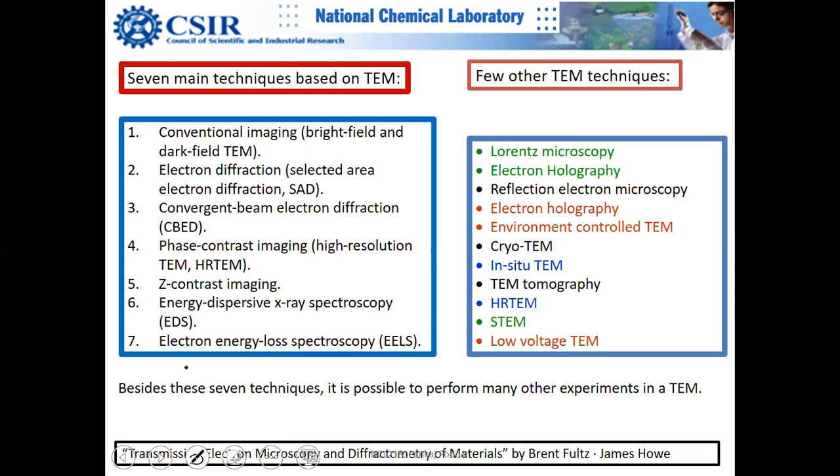Those bombarded high energy electrons will interact with the electrons which are part of the atoms you're probing, as well as the positively charged nucleus, through Coulombic interaction, right? So that is the electron-atom interaction. But there are certain features which are part of the lattice.